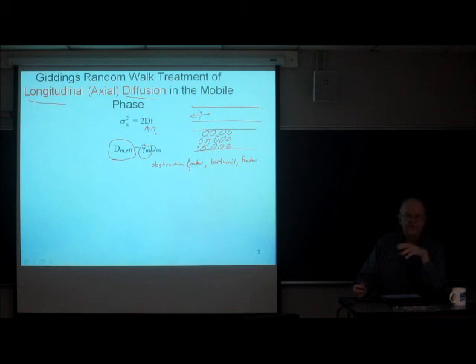There have been attempts to model this by computer experiments, but basically it can be measured experimentally by packing a column and making the measurement. And it turns out that this factor is more or less always between about 0.6 and 0.7. Obviously, it has to be less than 1 because this can only slow diffusion down.